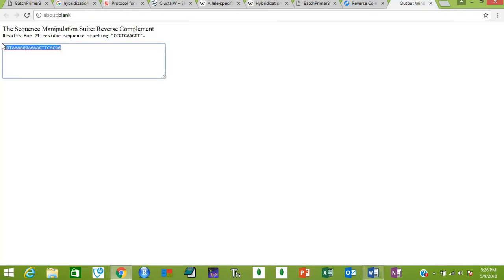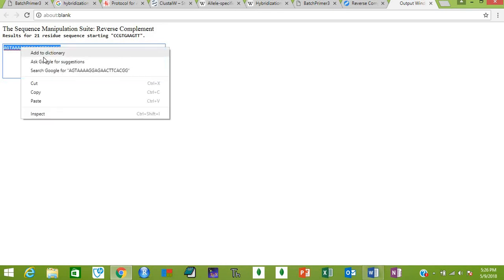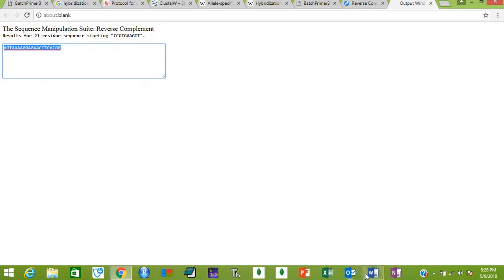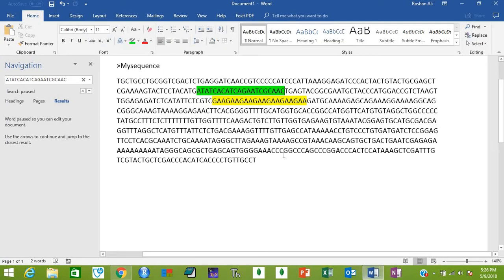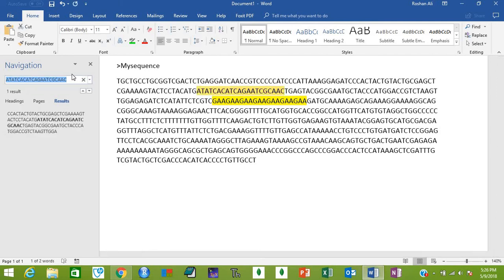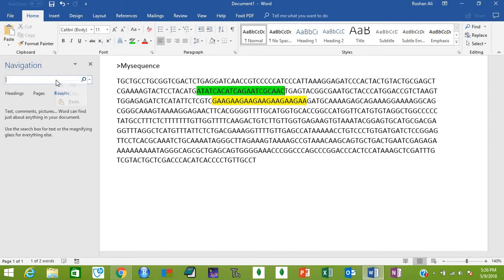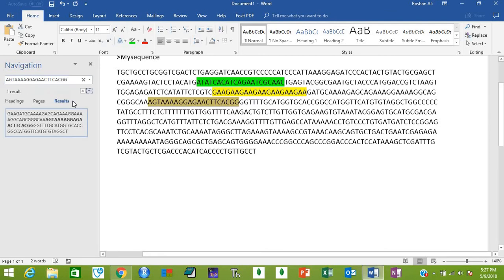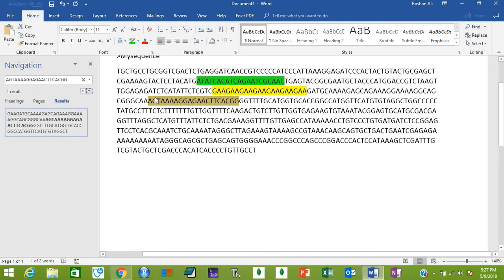Copy this sequence and check if it's found in your sequence or not. Again, Ctrl+F, remove the already pasted sequence, paste your new sequence, then press Enter. This is where your reverse primer will bind. Highlight it.